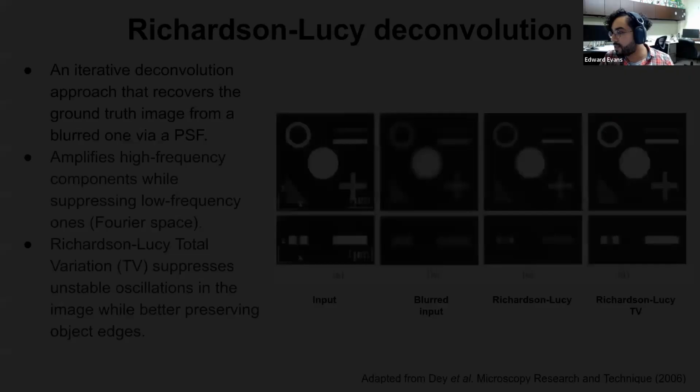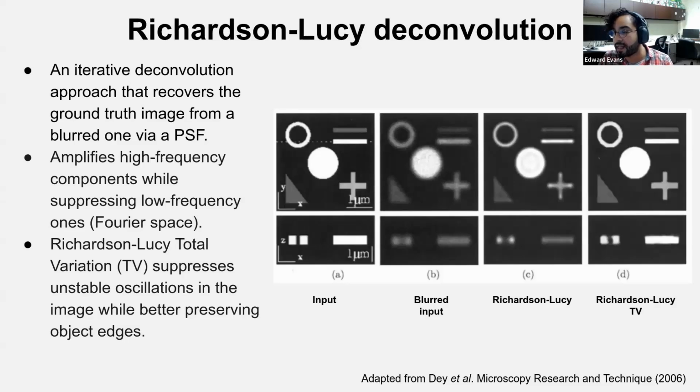In the interest of time, I'm going to talk about deconvolution real quick, and I'm going to show you where the script is, but we're not going to run it because I want to make a script with you guys. Okay, so real quick, Fiji has deconvolution in it. It's implemented by ImageJ Ops, and it's got two kinds: the regular variety and the total variation kind, which I think is honestly probably what you should use. I don't yet have a good reason why you shouldn't use it.